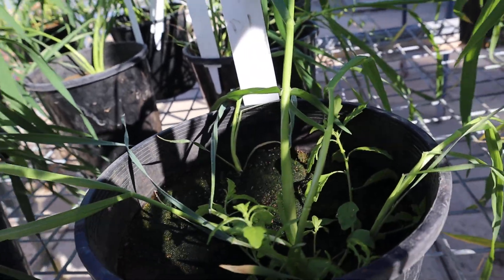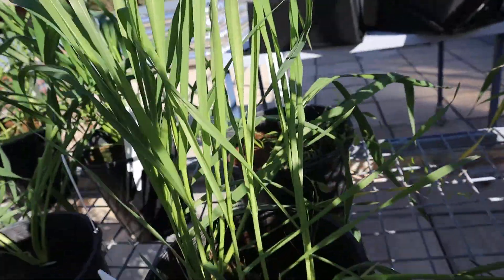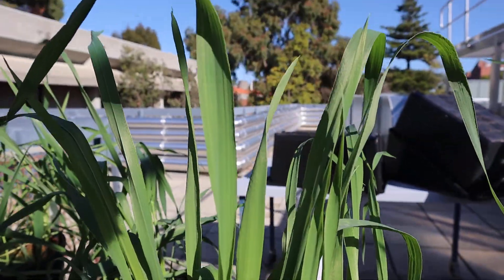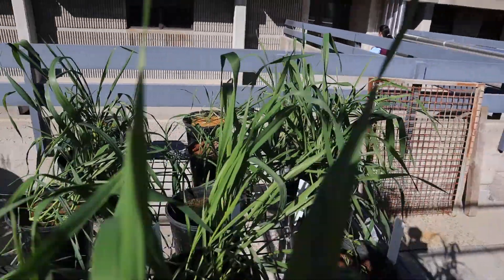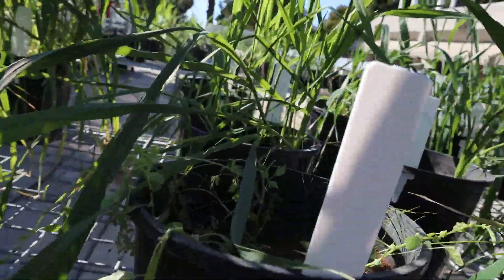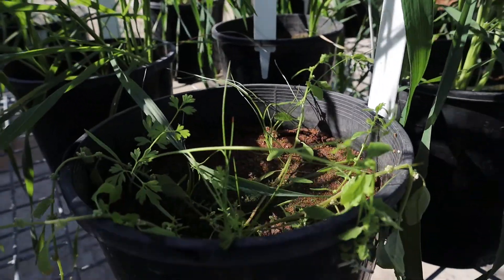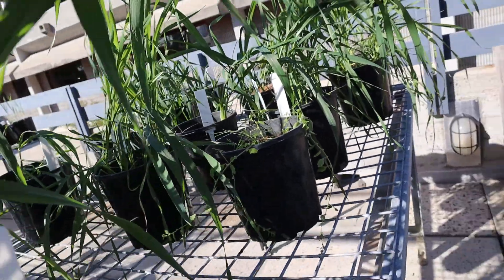We come to soil D, and again you can see we've got lots of weeds here — not great emergence in this pot. Again we have weeds in this pot. Plants aren't looking too bad in this one, but coming around to this pot, there's no germination and plenty of weeds.